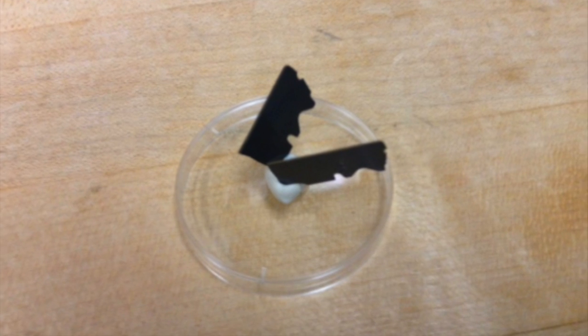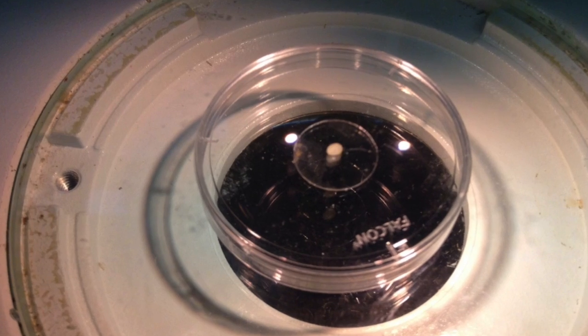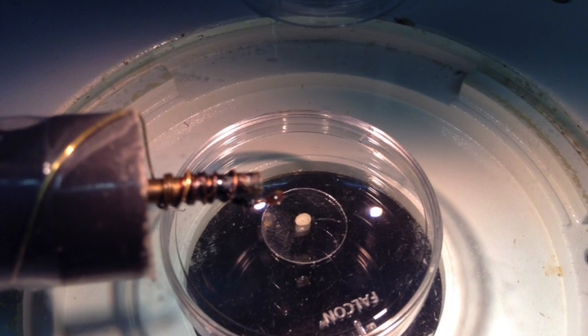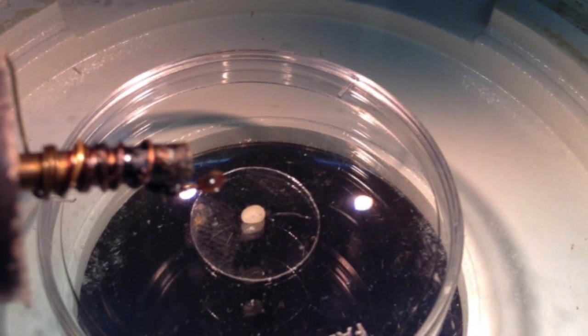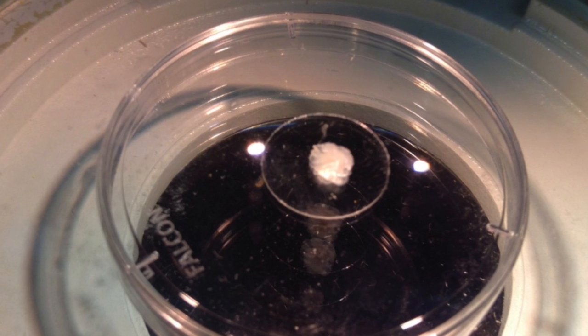Clean half of a blade with alcohol and water, then snap it into quarters. Melt a small piece of soft dental wax onto a 12mm coverslip. Place the coverslip in a 35mm Petri dish filled with Drosophila saline.